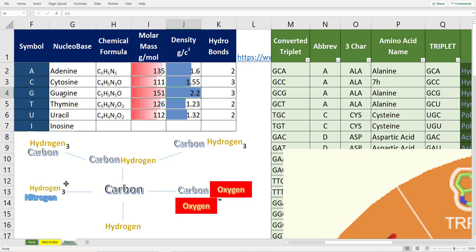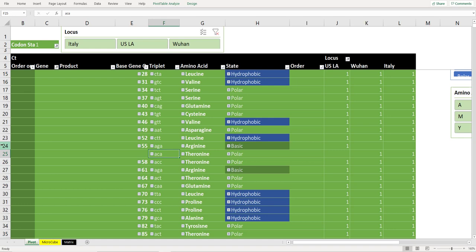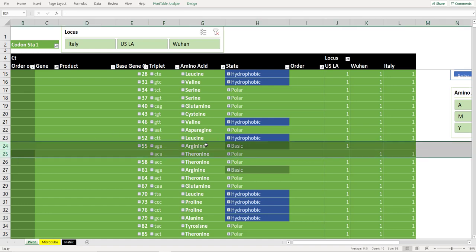It has more density. It's a bigger molecule. So that's what happens when you replace the C with the G in there. Okay? So cool. We found a mutation, not an insertion, but some type of mutation that has happened right around 55.